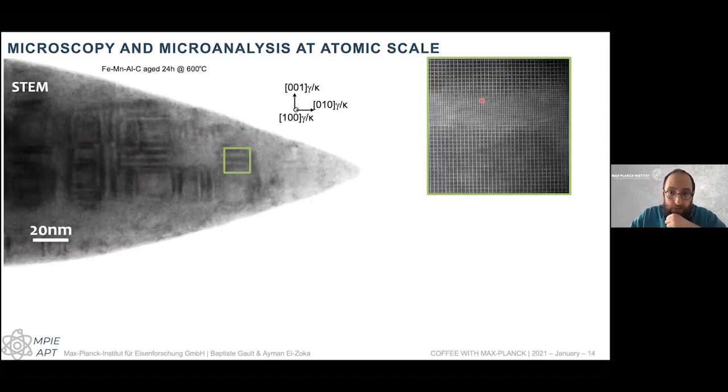And if I look at really high resolution transmission electron microscopy, I can see how the atoms are arranged in these different parts of the material. So here you have what we call a channel that is completely disordered, with iron, manganese, aluminum, all distributed randomly. And then inside of the precipitates, these atoms are arranged in a very specific way alongside the carbon. The problem is that techniques like TEM typically give us just one projection through the structure. We don't have the full three-dimensional aspect of the matter, but also, for example, we don't really know how to measure the content of carbon inside of these particles.